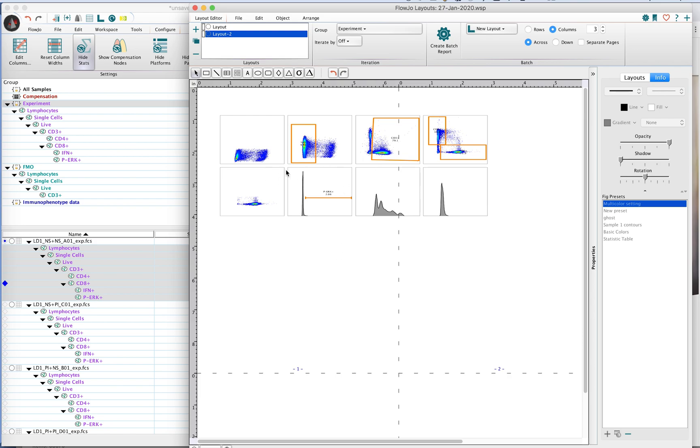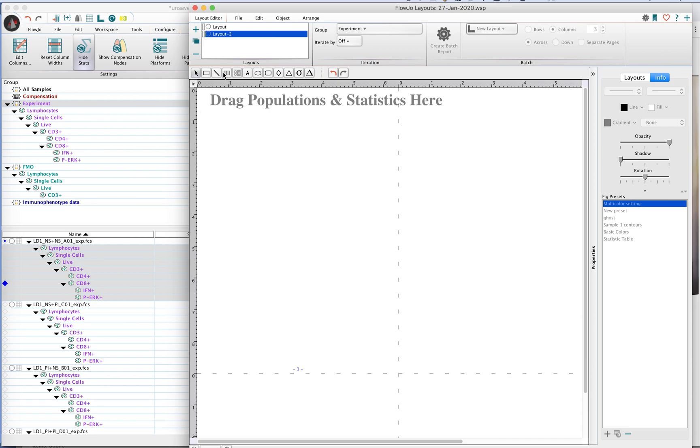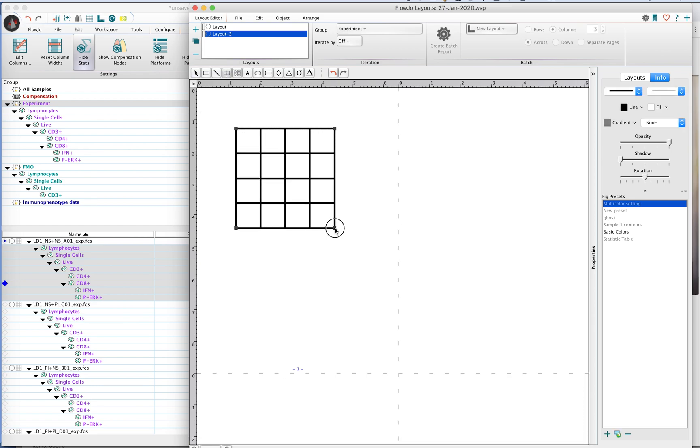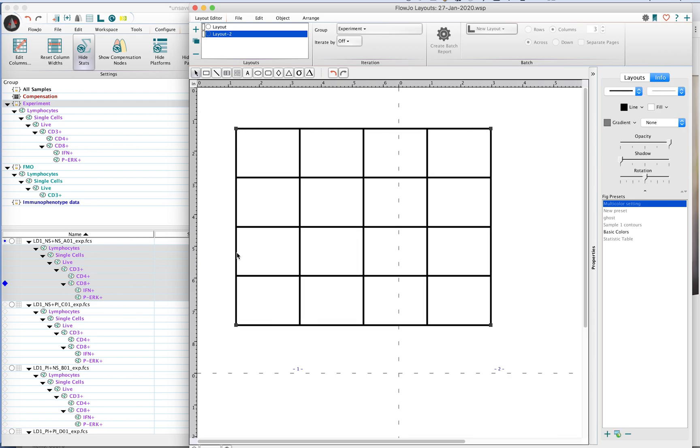Now you'll notice that the plots here will not have the axes labels. So if you would like to retain the axes labels by using the grid tool, we'll repeat the process but in a slightly different way.